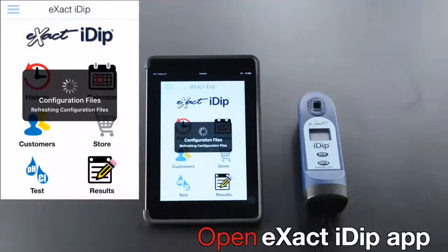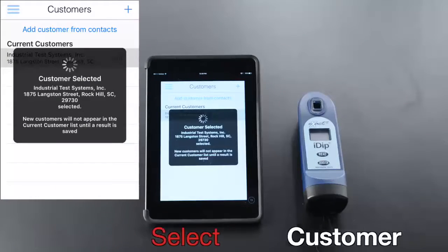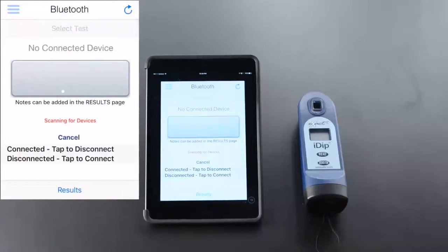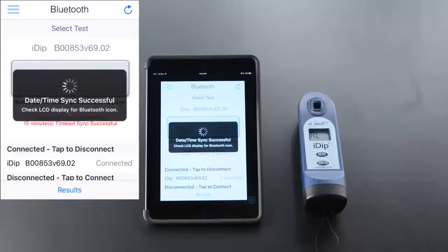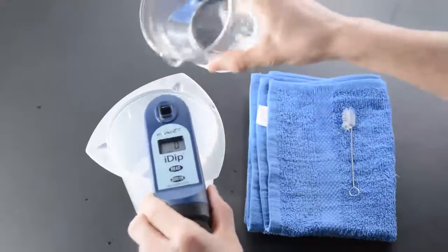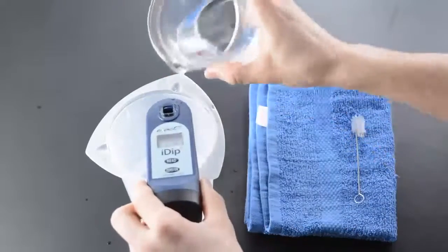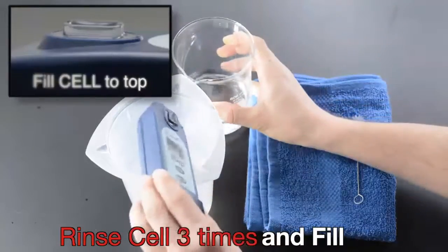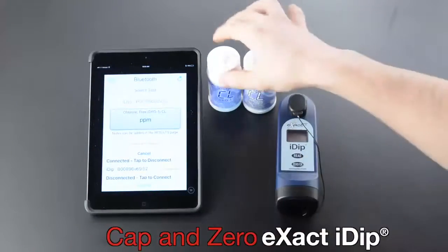Open the eXact IDIP app, tap Customers, select customer, open menu, and tap Bluetooth Test. Turn on and connect eXact IDIP. Clean cell with brush, rinse cell three times, and fill cell to top. Select Test Cap and zero eXact IDIP.